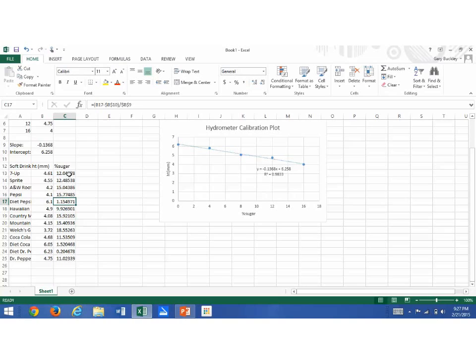When I put in B13 minus B10 over B9, what it's really saying is take the cell that's right over to the left of me, subtract the cell that's up in B10, and divide by B9. And it carries that all the way around. Very, very powerful types of materials.